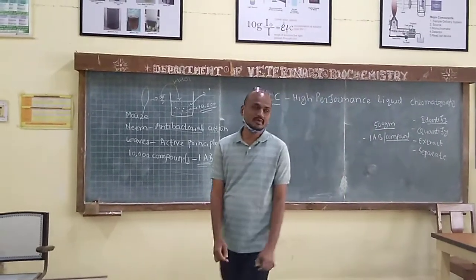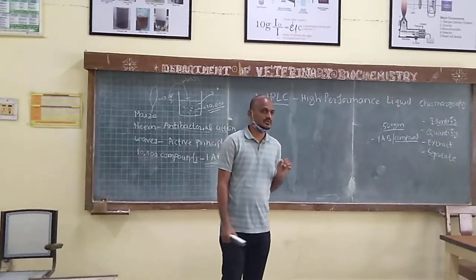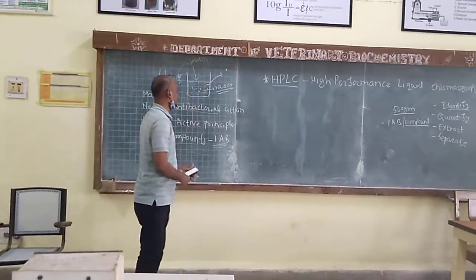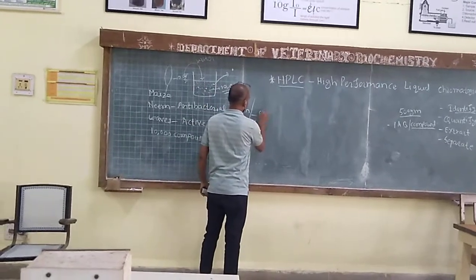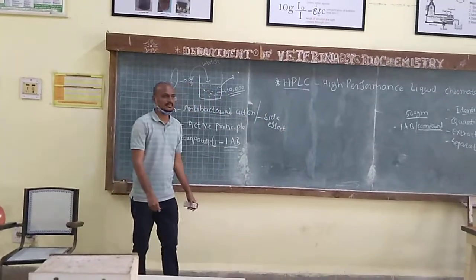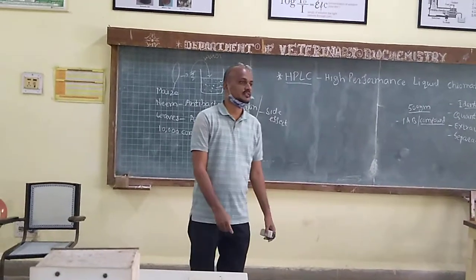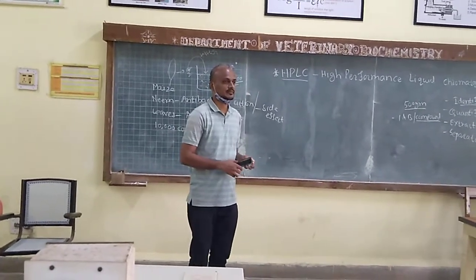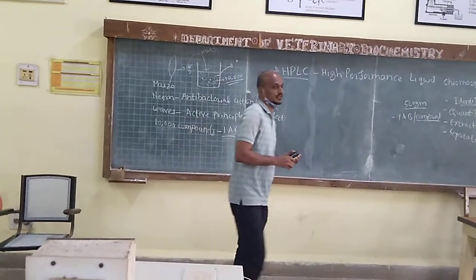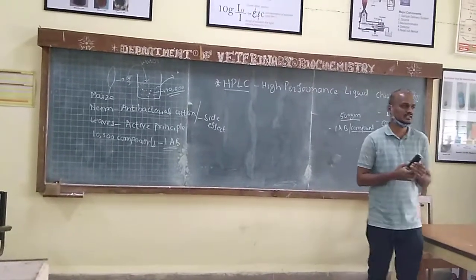Okay. So we have neem leaves. We have one antibacterial property as per you said, and now we want one molecule which will give the antibacterial property without side effect. So there should not be any side effect. Okay, no side effect should be there. So how to get that molecule? How do we get that molecule? Okay, by chromatography.